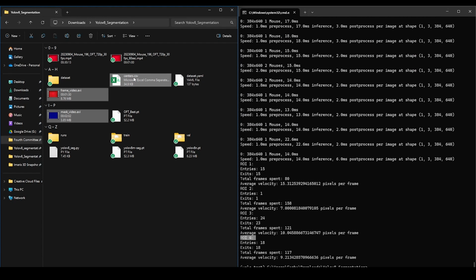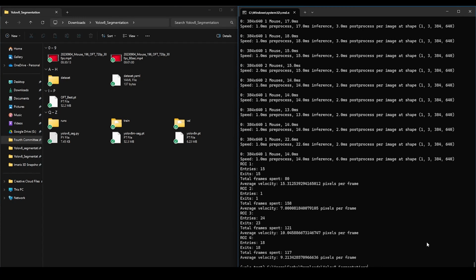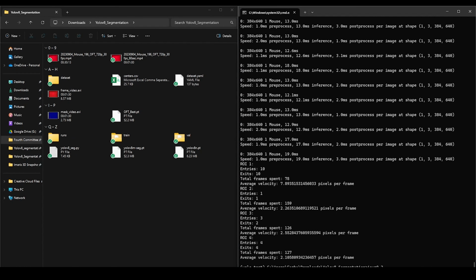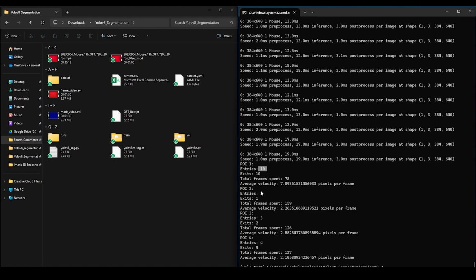Let me show you. Let's rerun the same video. With this, you can see there is a considerably smaller number of entries and exits.